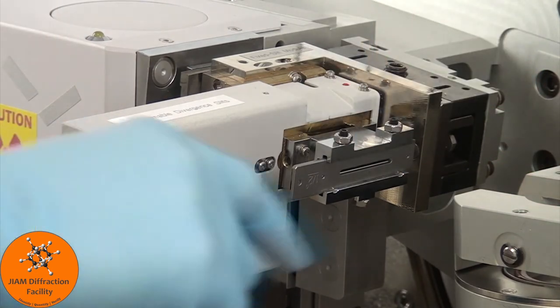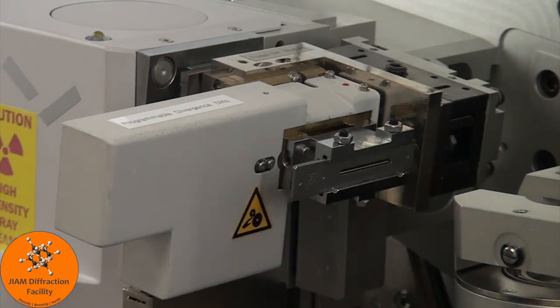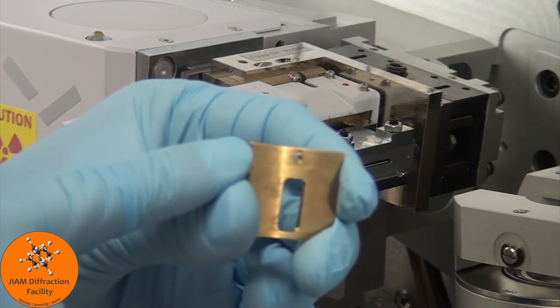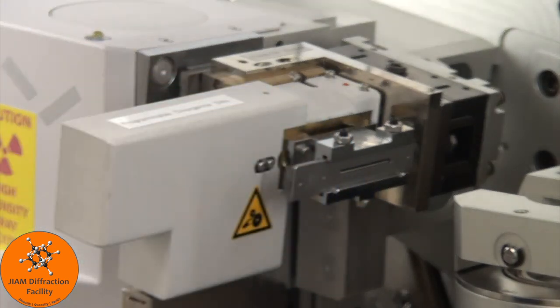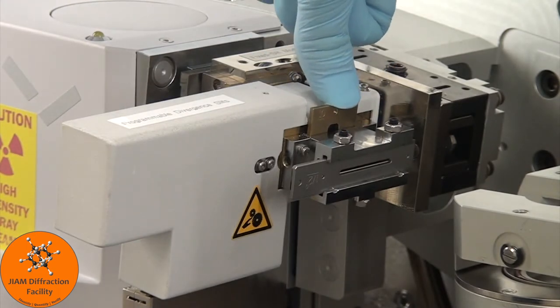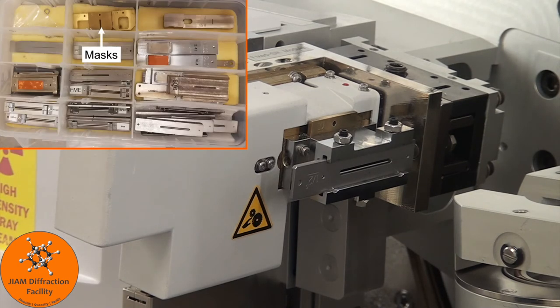When you do this, please don't rest your hand on the sample stage and press down on it. We can see right here that the mask is the 10 mask. And if you need to insert the mask, just simply press down until it rests in place. Sometimes it takes a little force, but that's okay. If you do need to change the mask, our other masks are located in a small plastic container near the computer. And you should see that in the top left portion of your screen.